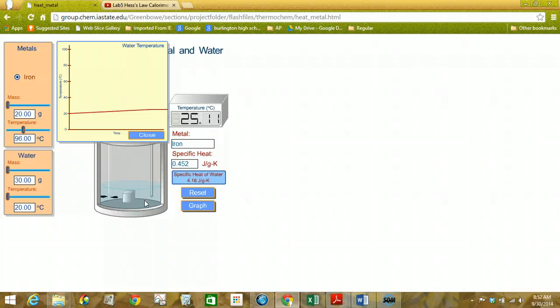The assumption is that this temperature, again, we're only actually measuring the temperature of the water, so that's an important thing to keep in mind. This temperature, though, once it's constant for the water, we know that heat is exchanged between two substances that have two different temperatures. So once the two substances have the same temperature, that heat transfer process is going to stop. So that's why we're going to use this number.